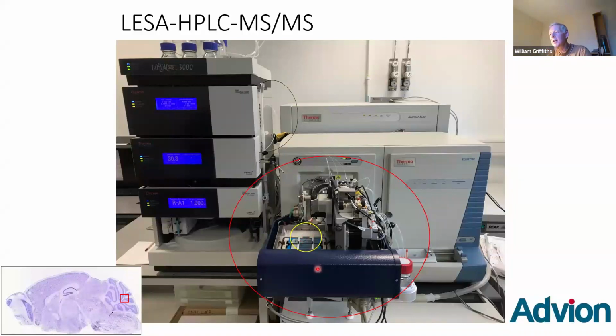What we're now going to do is liquid extraction in small areas. Take the liquid extraction and then put it onto an LC system to separate the isomers and do spot analysis. So let's explain to you how this works.